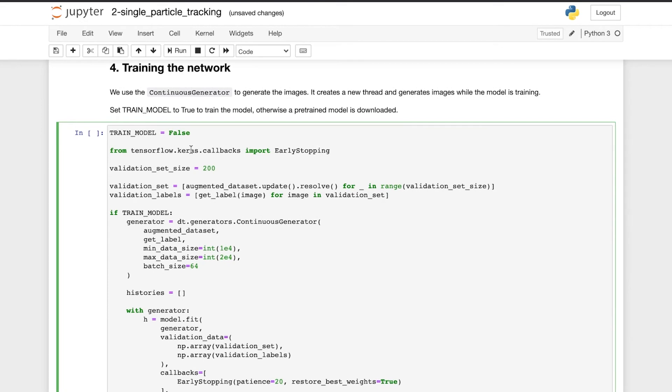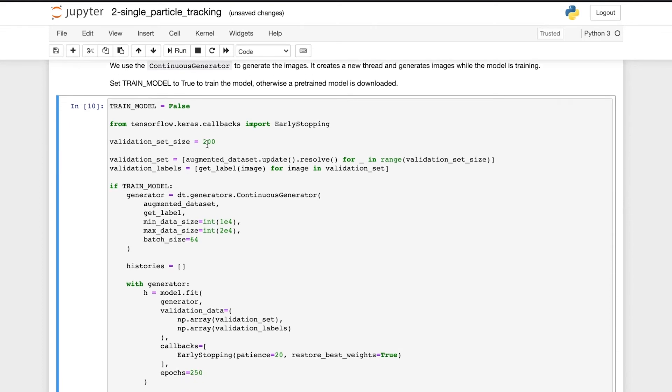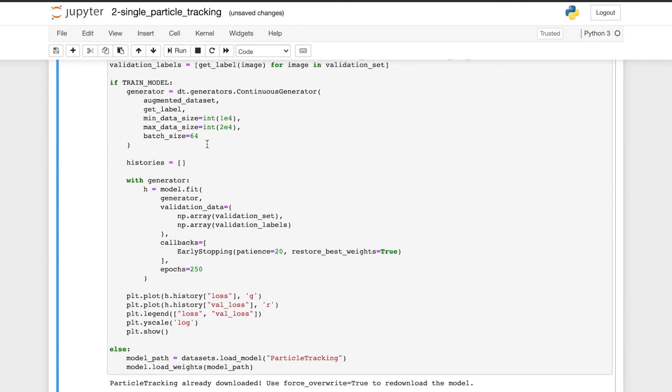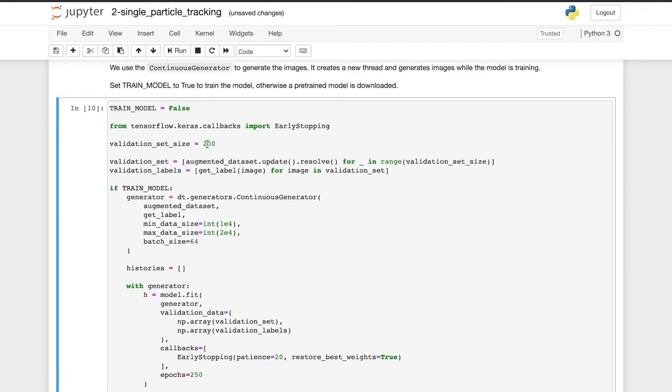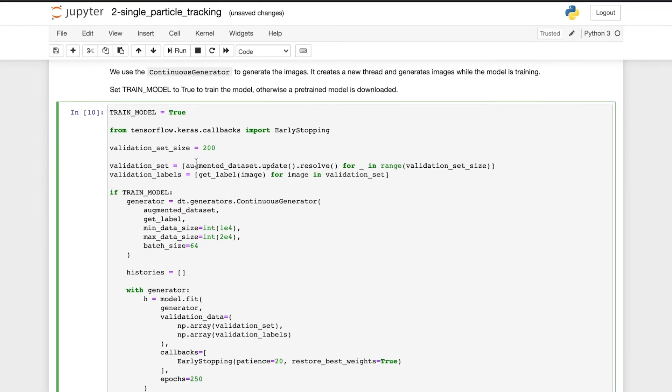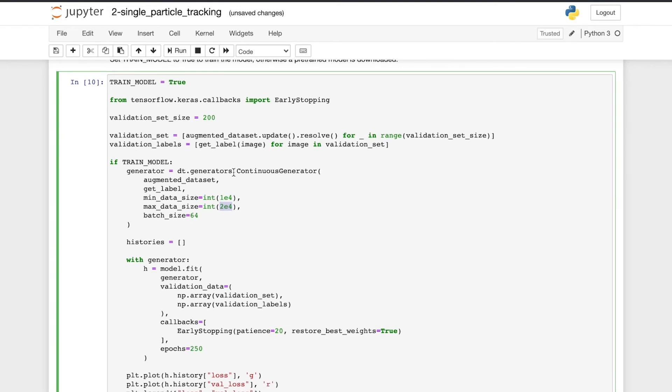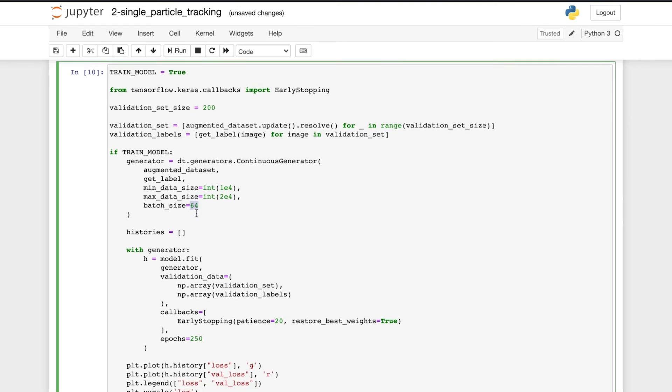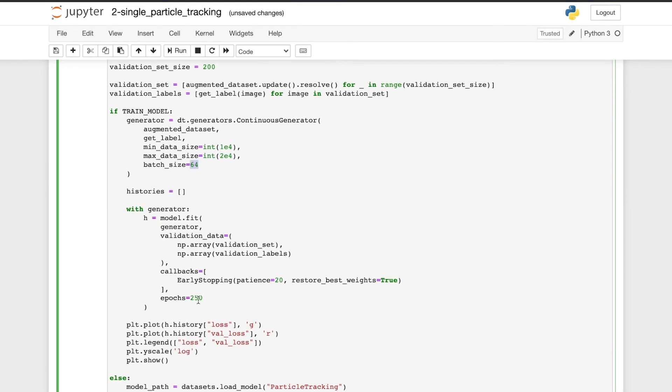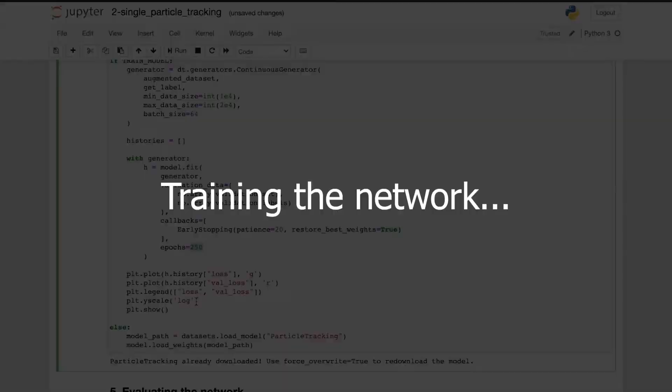And now for the training of the network. If we keep train model as false, we load the pre-trained network that we have available for this problem. But if we want to train a new model, we change train model to true. Here we have a validation set of 200 images and a minimum of 10,000 training images and a maximum of 20,000. And we use a batch size of 64 and 250 epochs in the training. And now let's train the model.